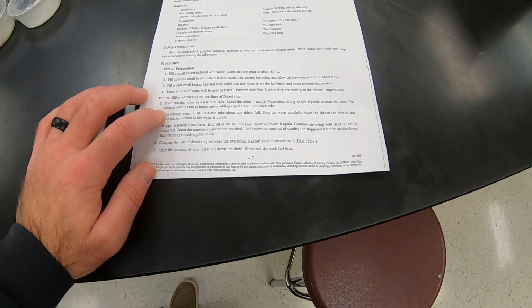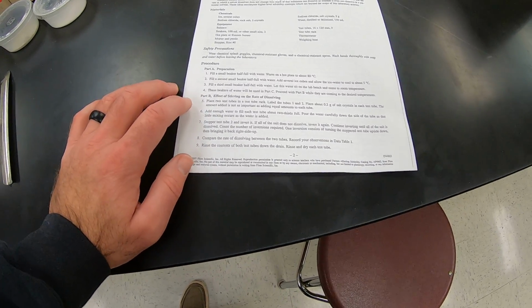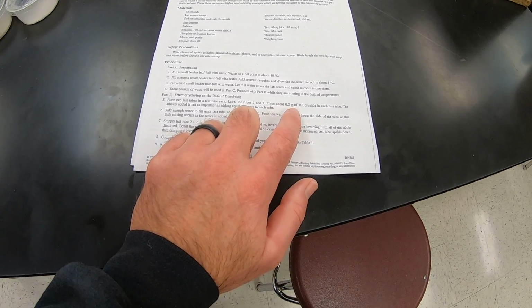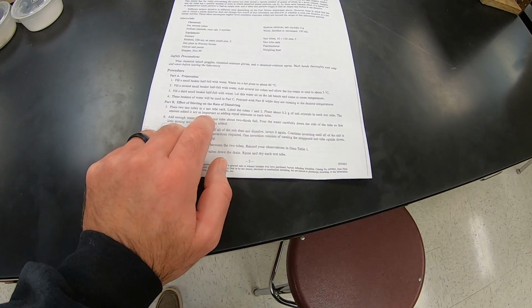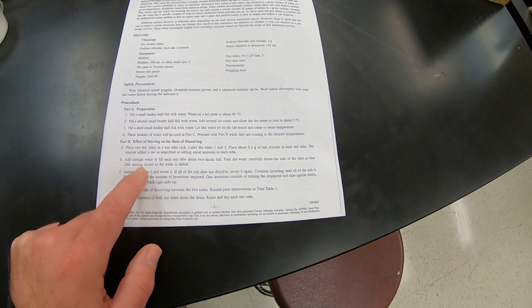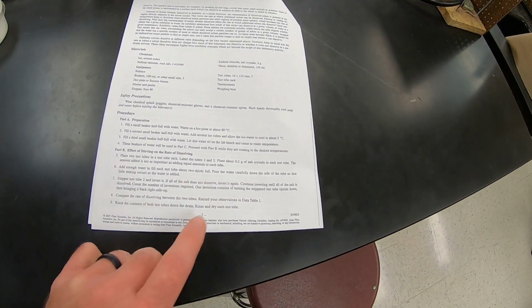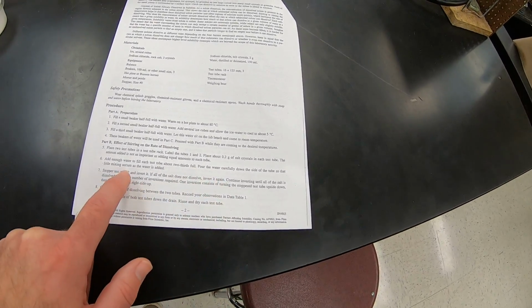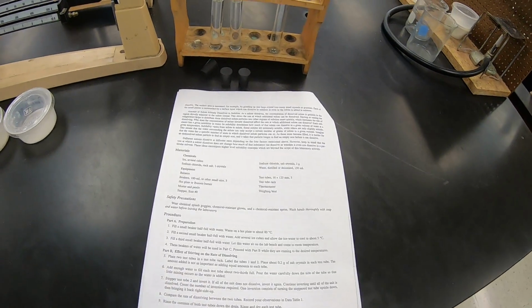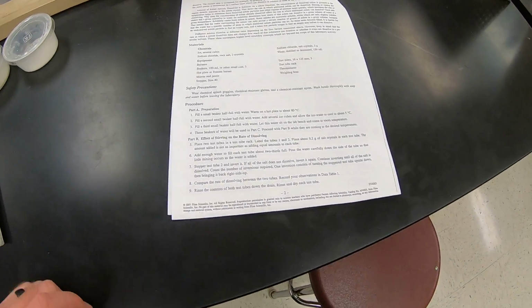Part B, it says place 2 test tubes in a test tube rack. Label the tubes 1 and 2. I'm not going to label them. Place 0.2 grams of salt crystals in each test tube. The amount added is not important as adding equal amounts. And then fill each test tube 2/3 full of water. Pour the water carefully down the side so it doesn't mix it. We're going to actually add the water first and then put the salt in. I think that works better.